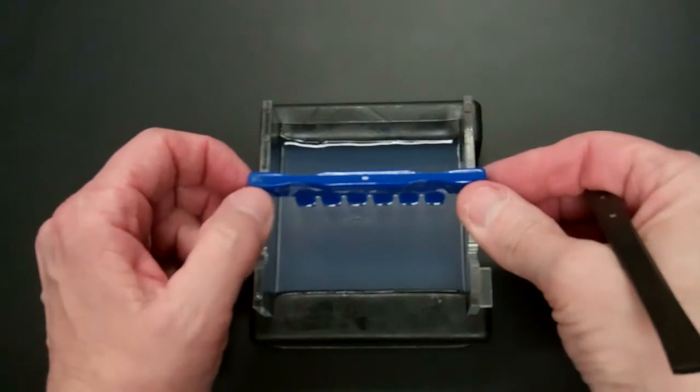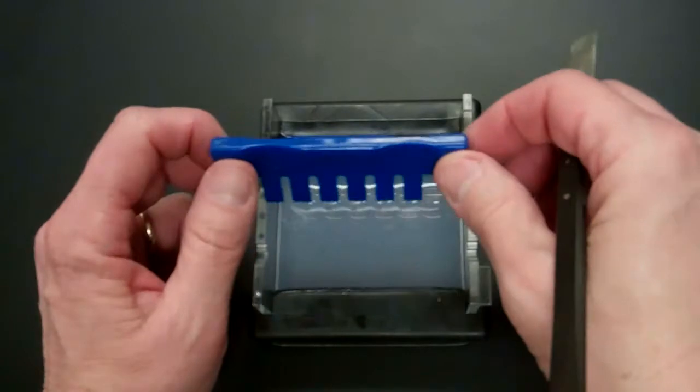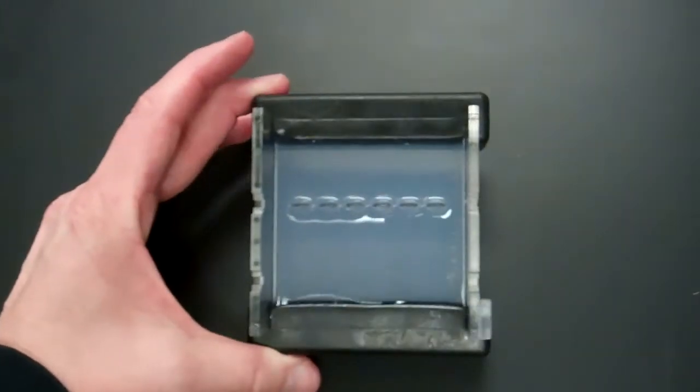So straight up, you want to take the comb out by lifting the comb straight up. And now you can see the wells that have been made.